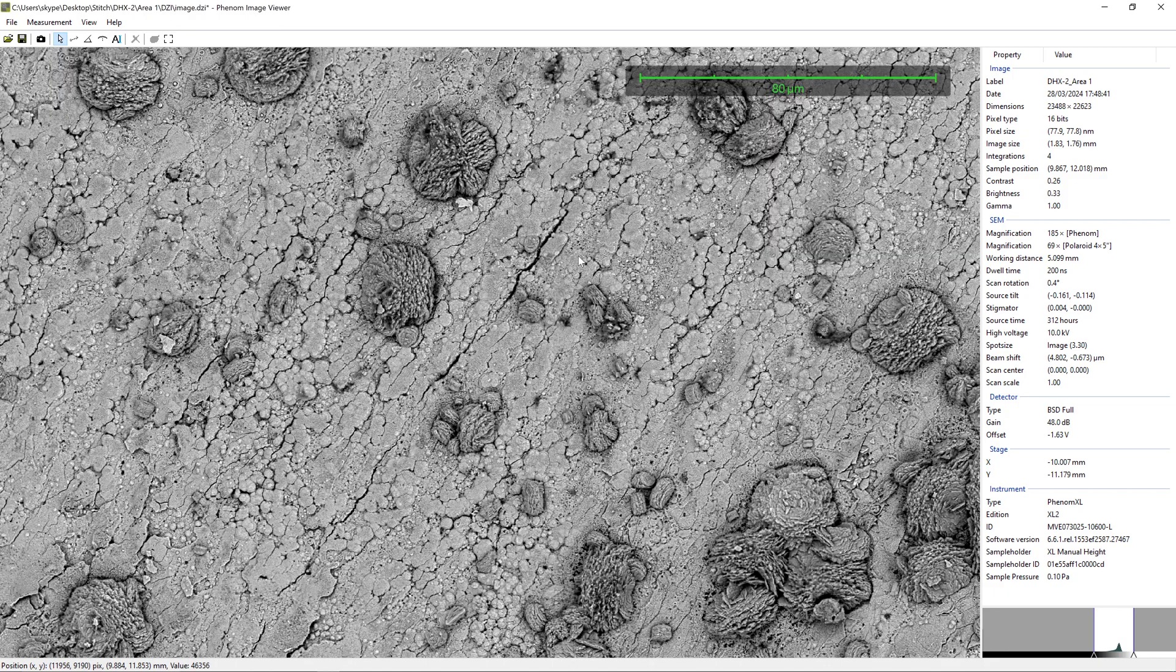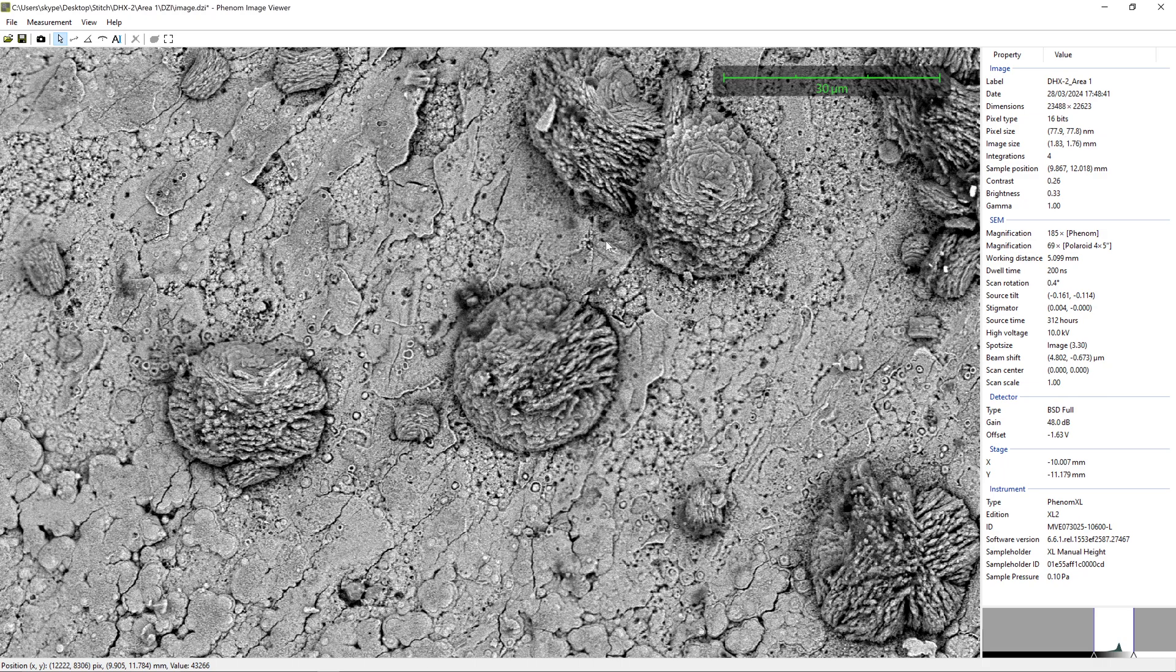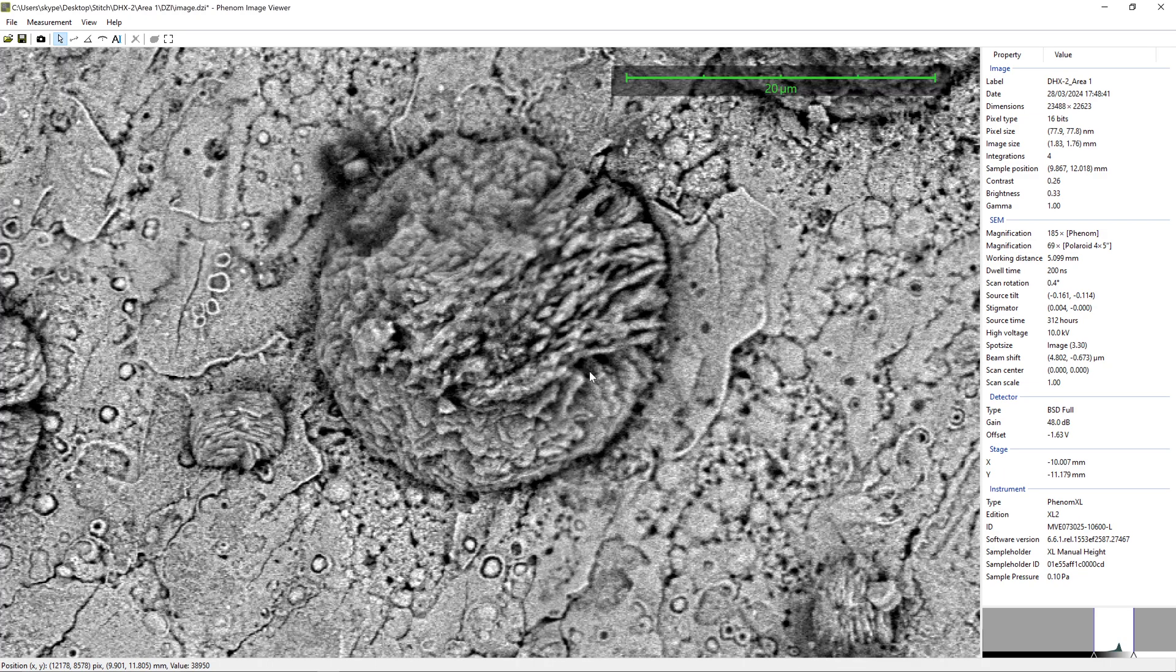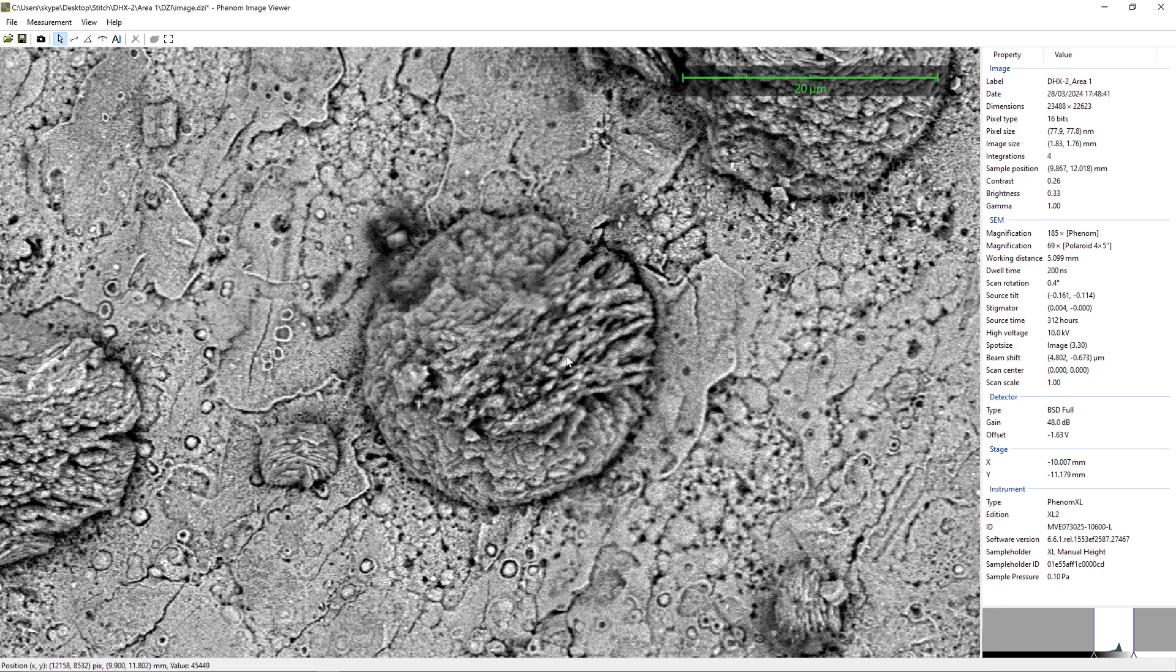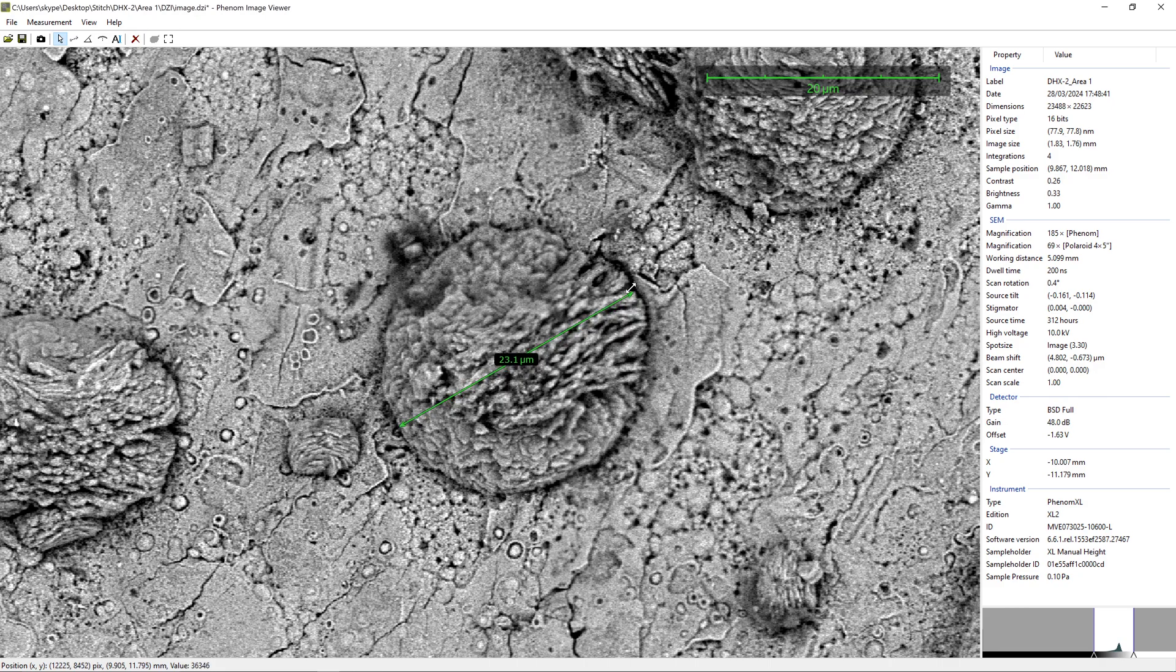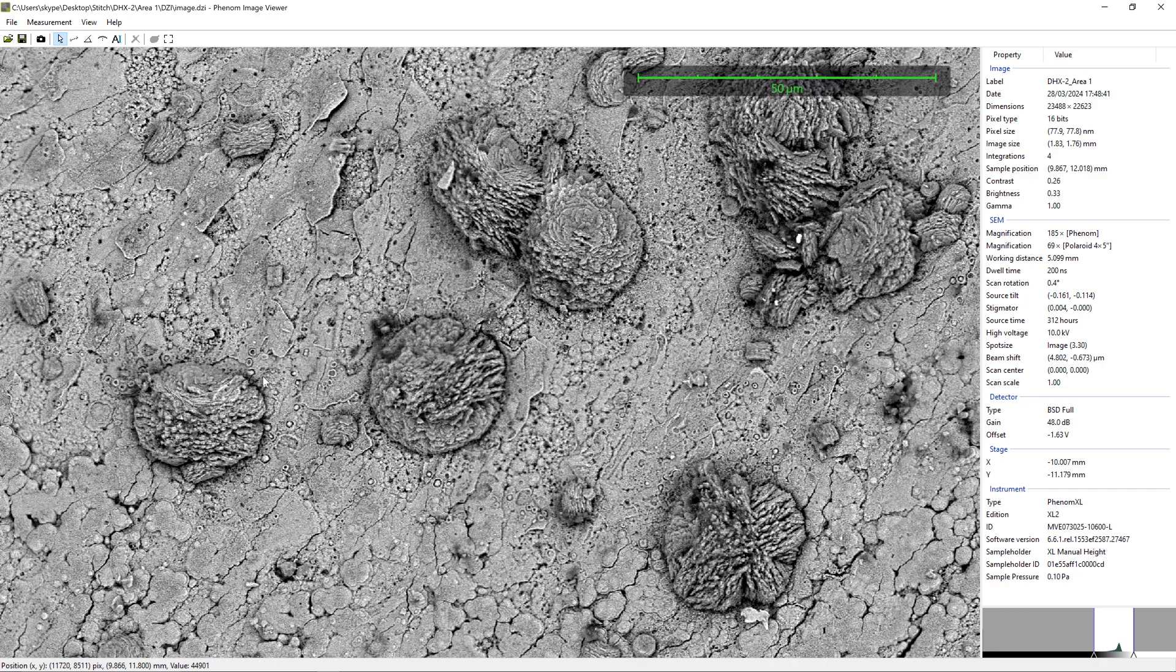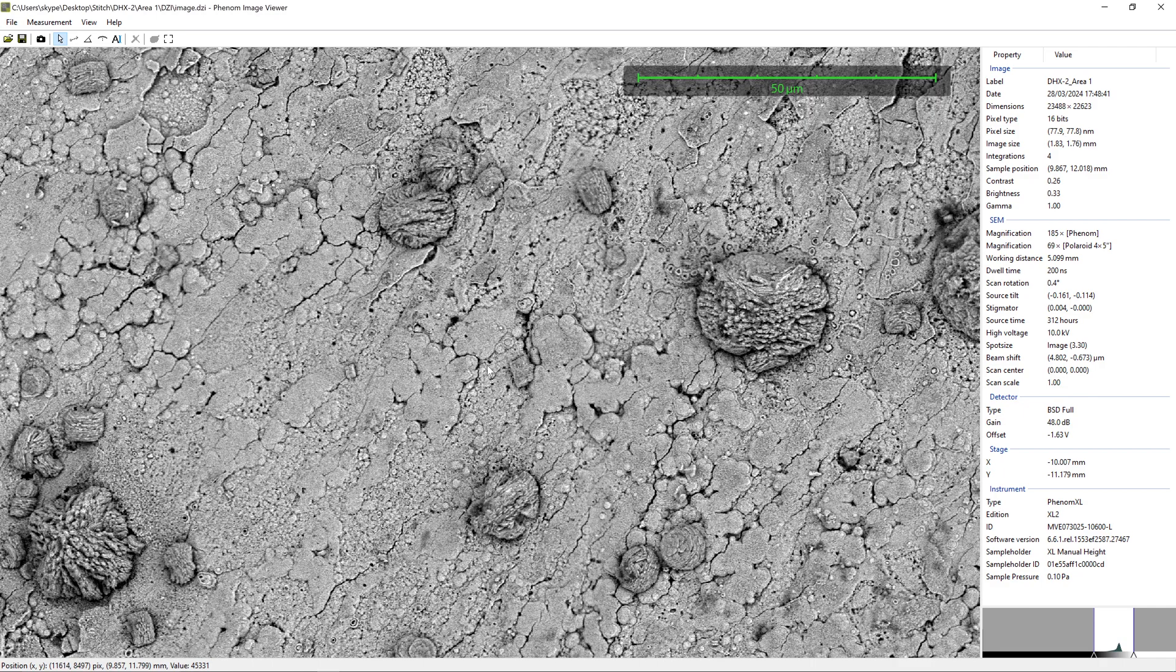And you can also do things like measure these things. So I can zoom in to one of our structures and we can use a length tool here and we can measure across our structure here. So we can see this one, in this case, is measuring at about 23. And you can also add annotations and then you can do a screen grab of what you're looking at and share with the community.